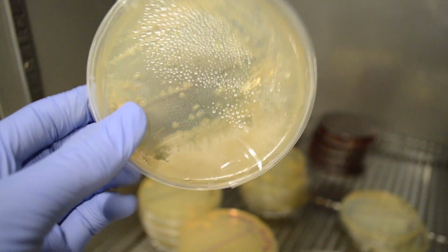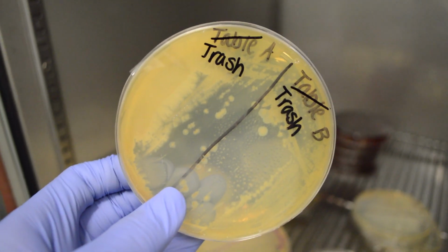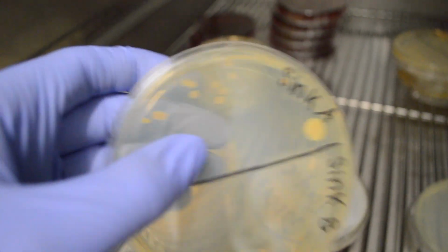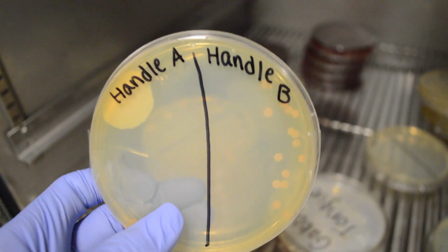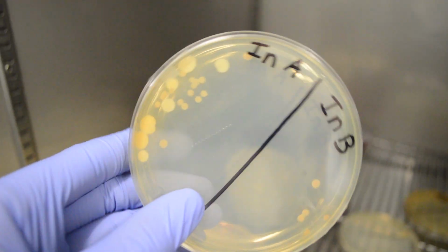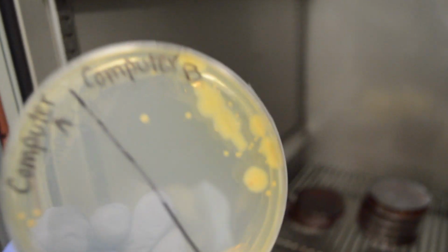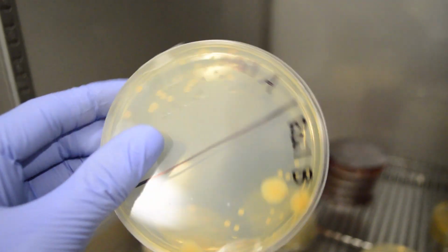Let's check it out. The most growth, expectedly, was seen on the trash cans. And yes, this is what comes off the part of the trash can that you touch. We've also got significant growth on the toilets and bathroom sinks. This is embarrassing. The handles to hallway doors and inside of these doors also show some colonies. Notice how we got 2 swabs or trials for each location. This was to ensure that the microbes we see are not just there by chance.